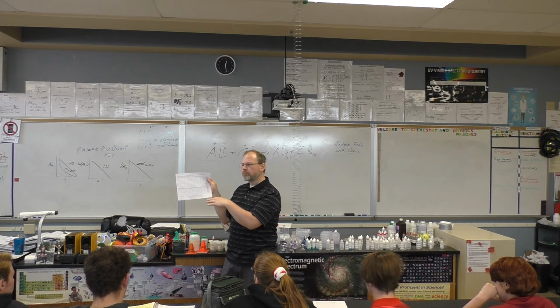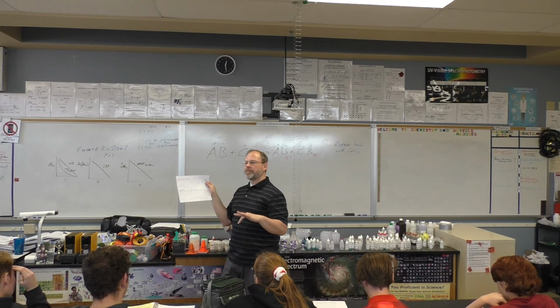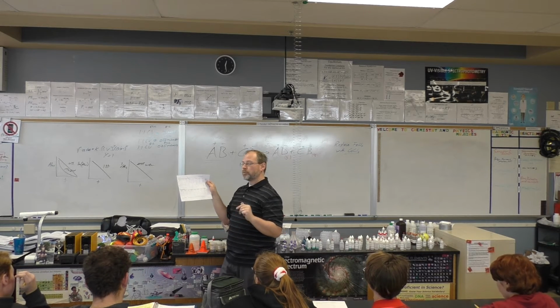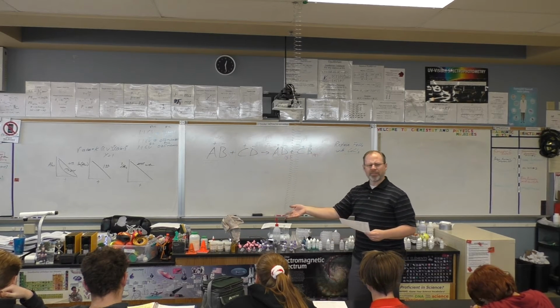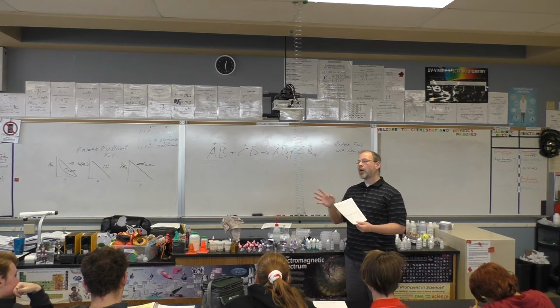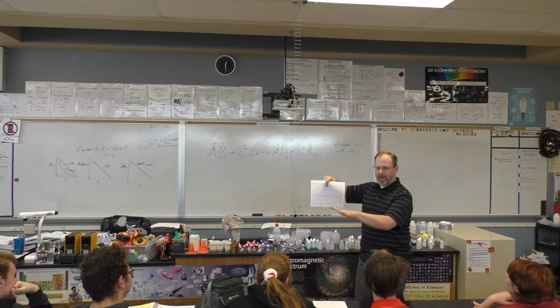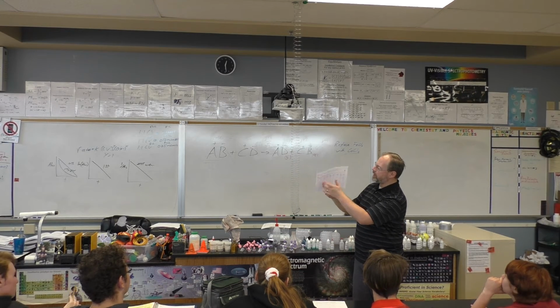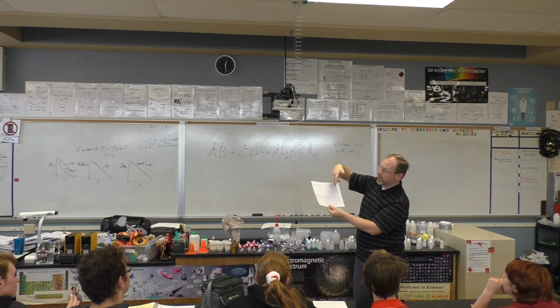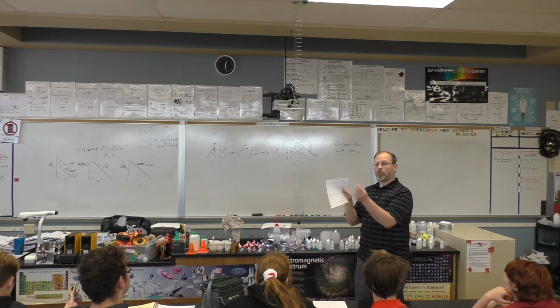Cool? The number of precipitates, I'm going to say more than 5, less than 15. So somewhere in that ballpark. Hopefully you haven't contaminated your chemicals. Okay, does that make sense? Now, that's all we're going to get to today. In fact, some of you might not be able to finish part 3. Perfectly fine. We're going to work on this tomorrow too. Okay? But definitely get all of your data and start part 2, or at least get part 2 done, maybe start part 3.